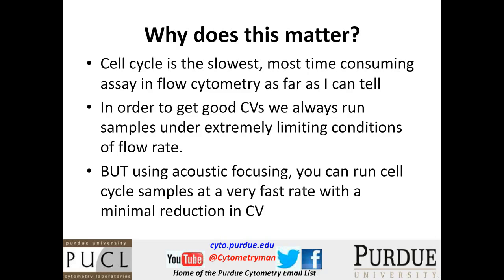Well, cell cycle is something that I've always sort of hated doing. And not just me, the technicians in the lab don't like doing it at all because it's so slow and everything has to be so perfect. And you've got to be so worried about blockages and keeping the flow rate nice and stable.